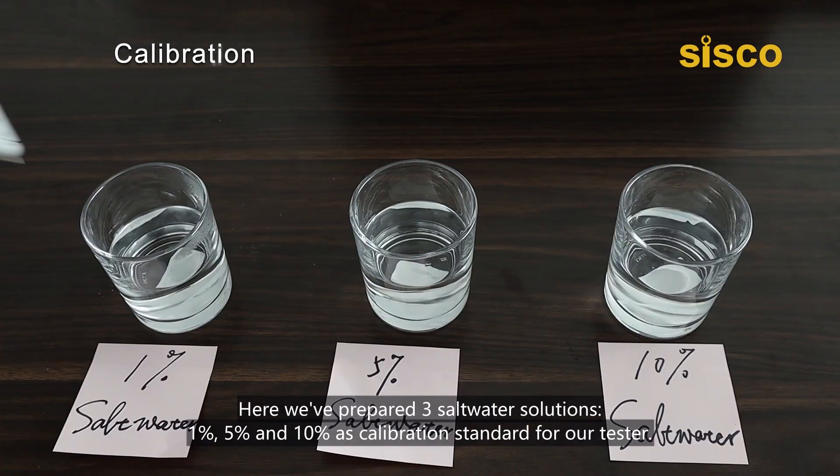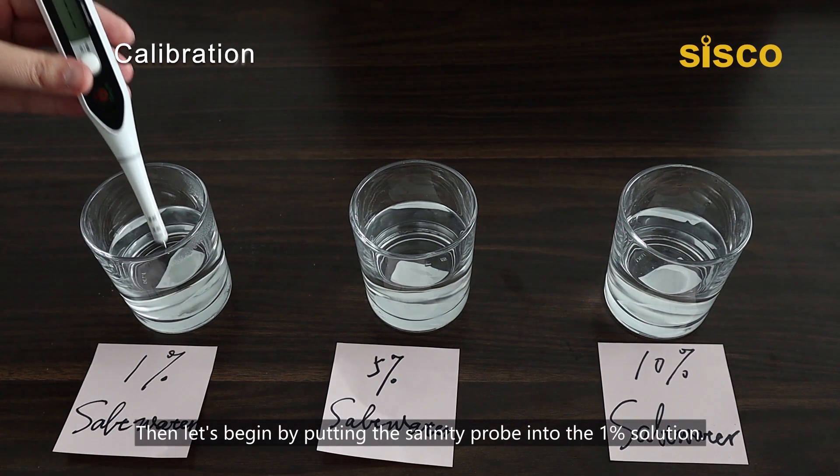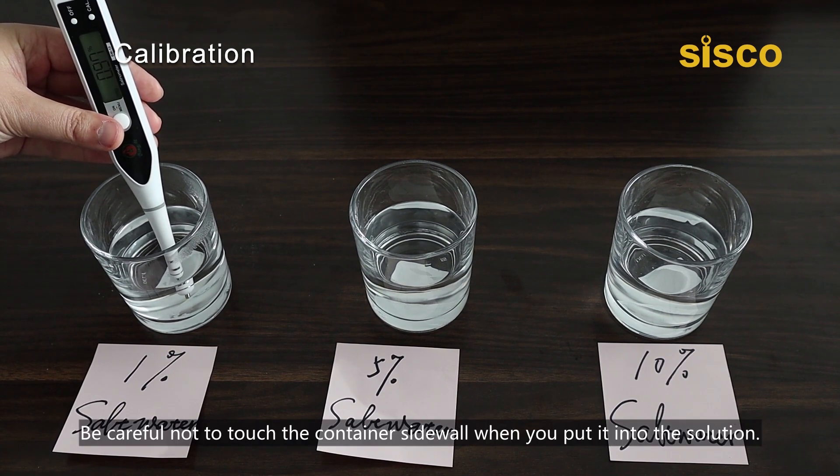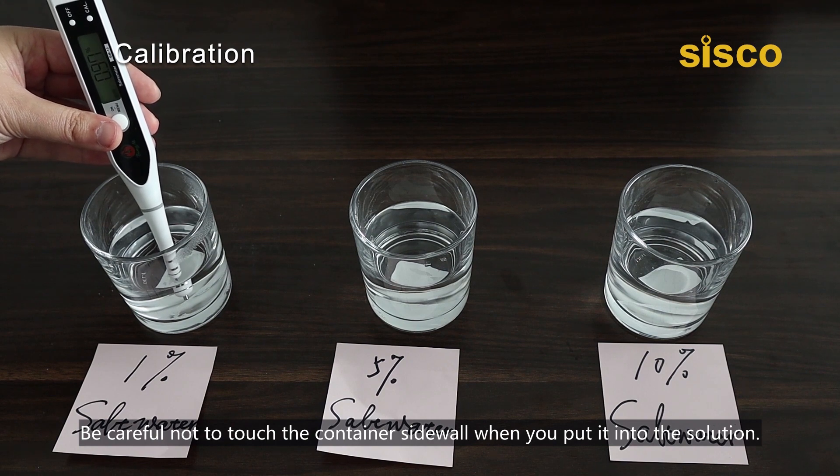Here we've prepared three salt water solutions: 1%, 5%, and 10% as calibration standards for our tester. Then let's begin by putting the salinity probe into the 1% solution. Be careful not to touch the container sidewall when you put it into the solution.